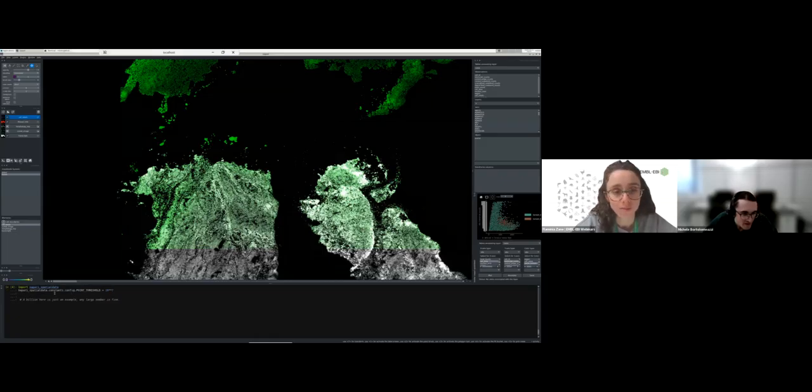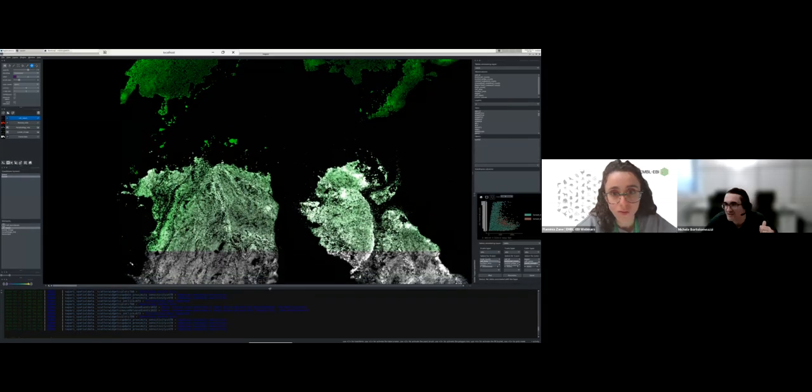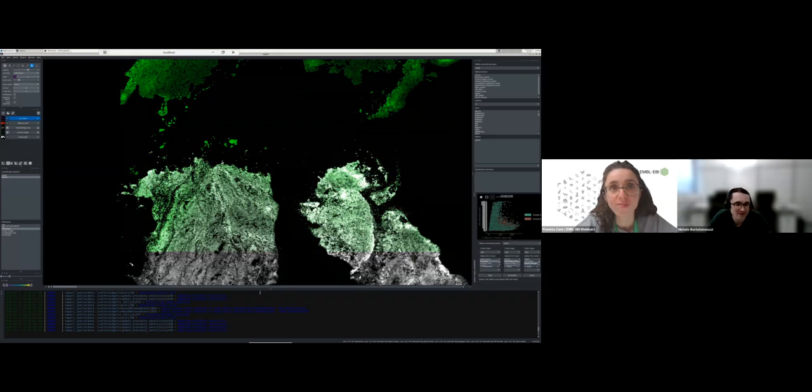I import napari-spatialdata and then set this constant here from the console. I have the code snippets in the repository from the workshop. So this is the way it's done, but if you want to reuse this, the code should be there. Once we share the slides, I'll also send the link.